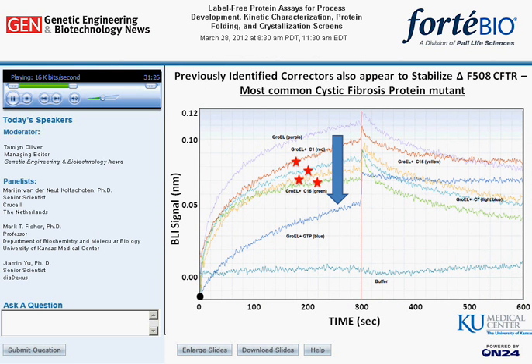Most importantly, this slide shows that these potential stabilizing compounds that appear to stabilize the normal domain also appear to stabilize a mouse mutant containing the common phenylalanine-deleted CFTR-NBD1 domain. Although this single domain has previously been used as a model system for this protein folding disease, the current consensus in the field is shifting toward approaches that use the complete transmembrane regulator protein as a model to search for pharmacological chaperones. Nonetheless, our experiments still validate our approach for rapidly identifying potential stabilizers of misfolded proteins.